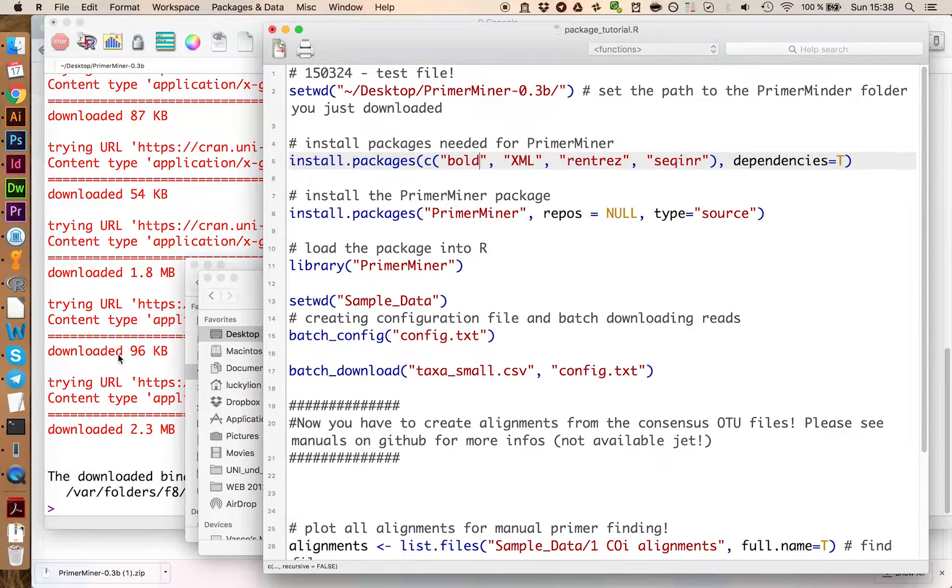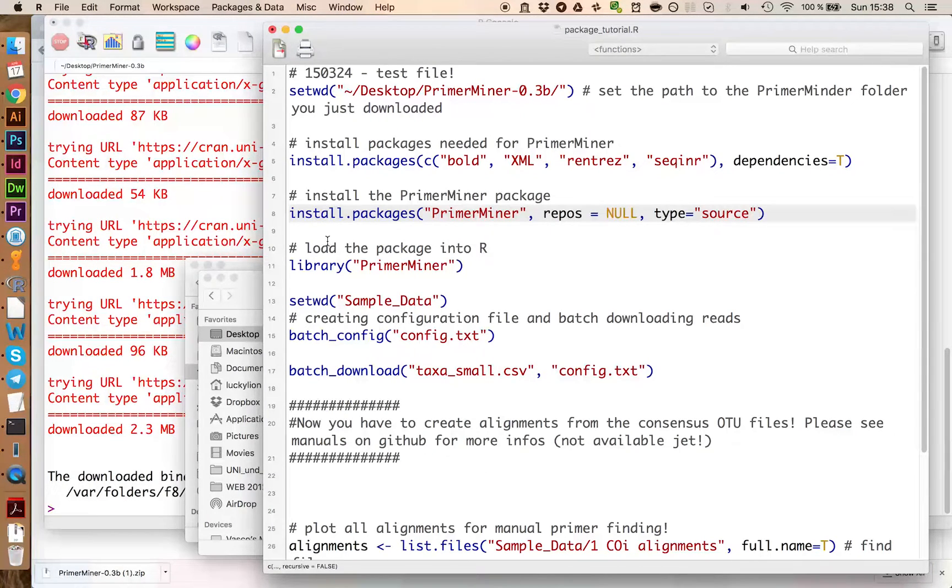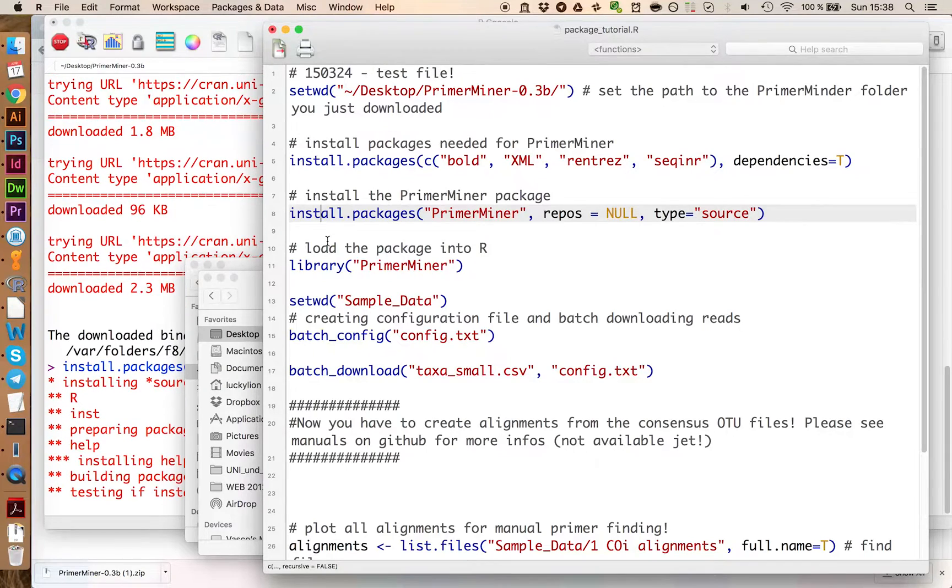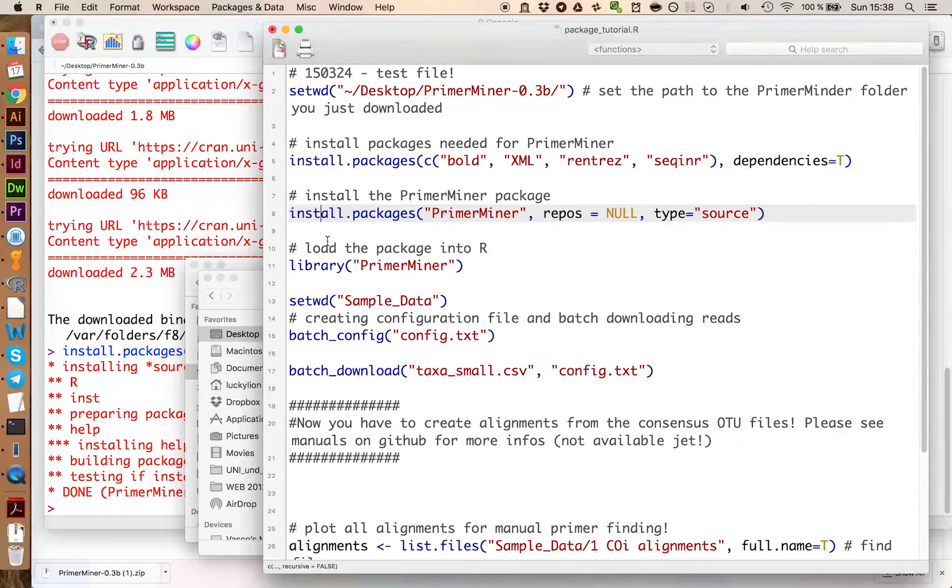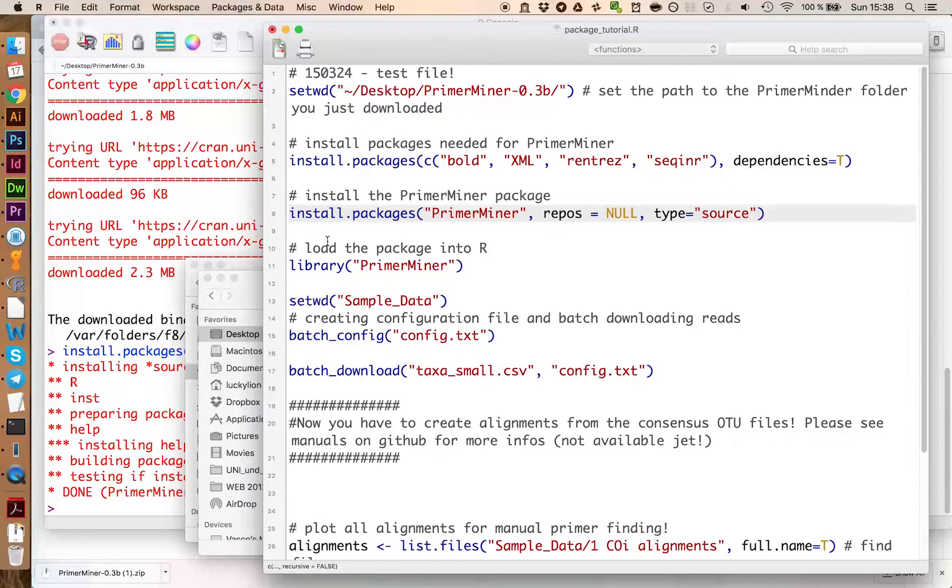Now all packages are installed and we can install the PrimerMiner package by just running this command here. This will install the PrimerMiner package based on the files we have downloaded from GitHub.